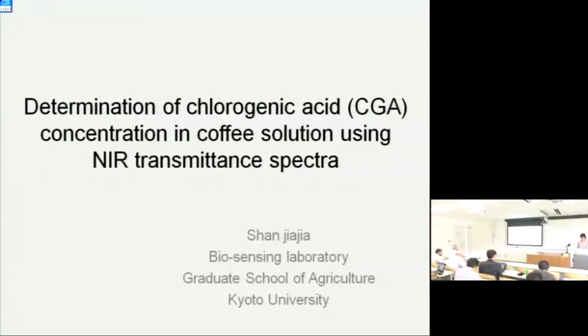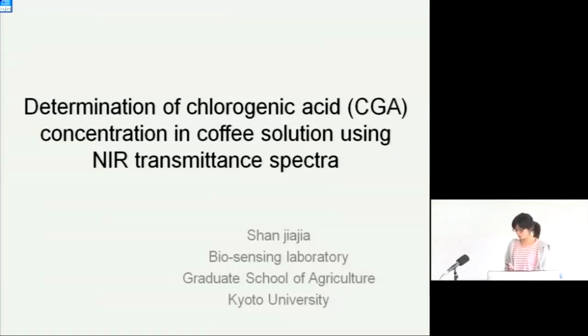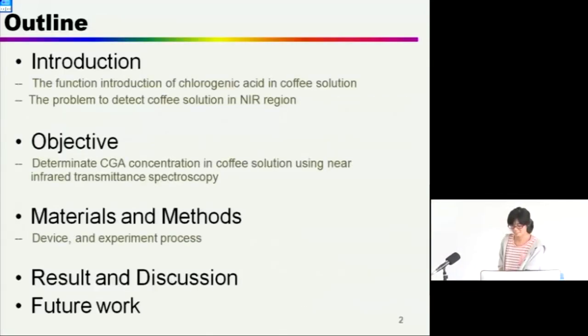Good morning, everyone. Today I will introduce my research: determination of chlorogenic acid concentration in coffee solution using NIR transmittance spectrum. The outline of my presentation today includes 5 parts. The first part is the introduction.